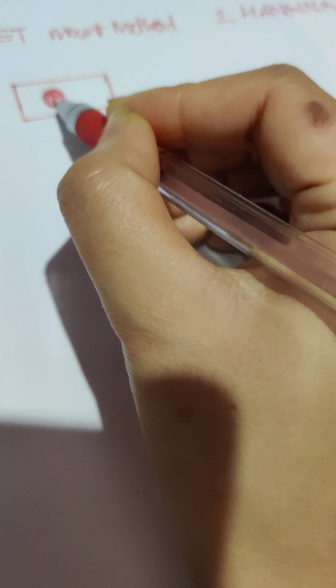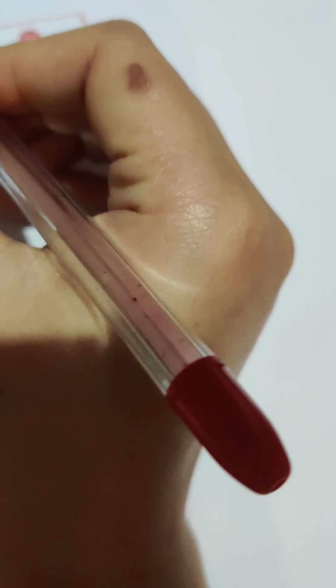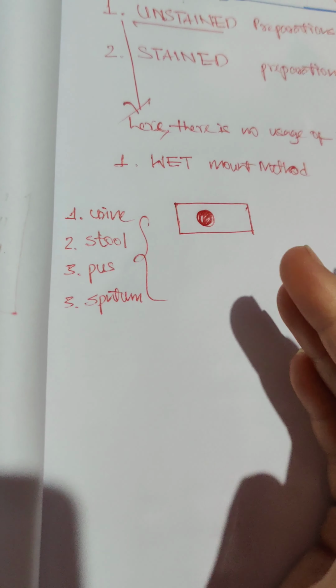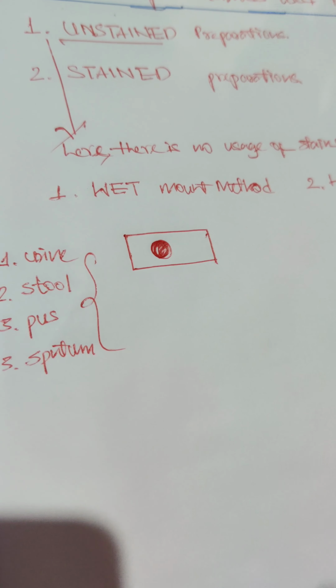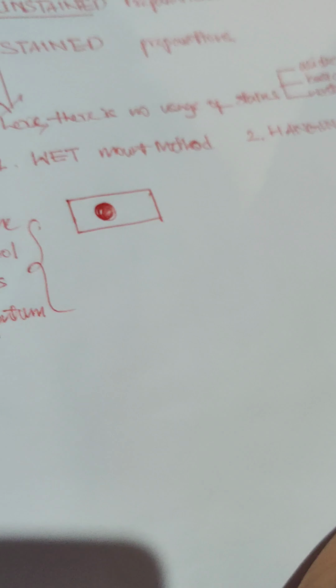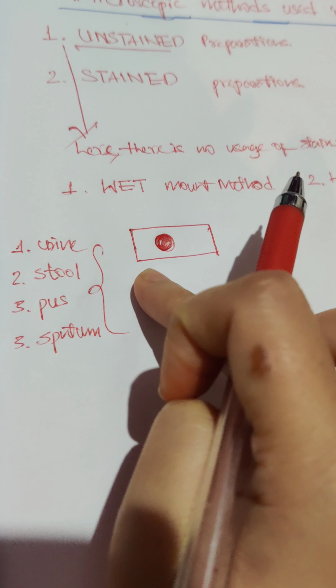These samples could be urine, stool, pus, or sputum, any kind of discharges. We put the specimen on the glass slide.